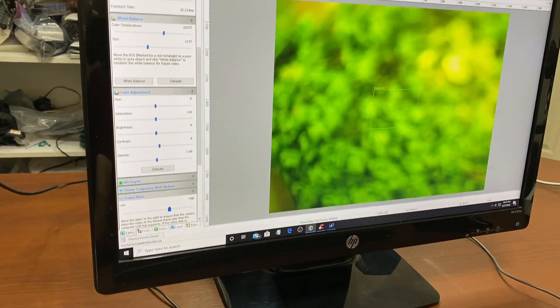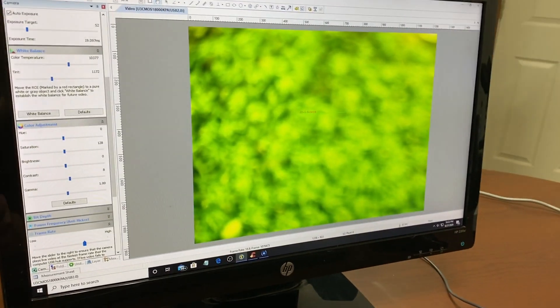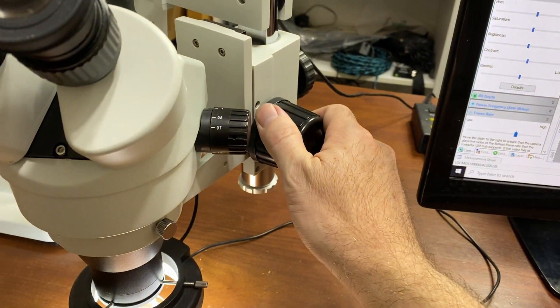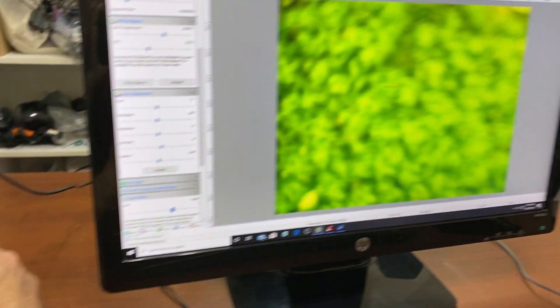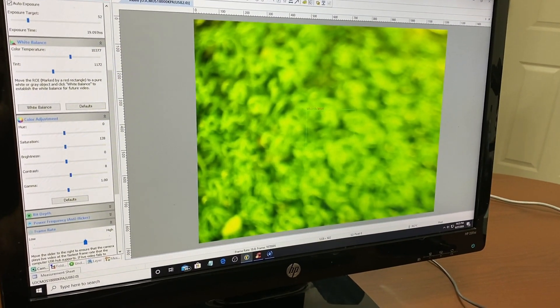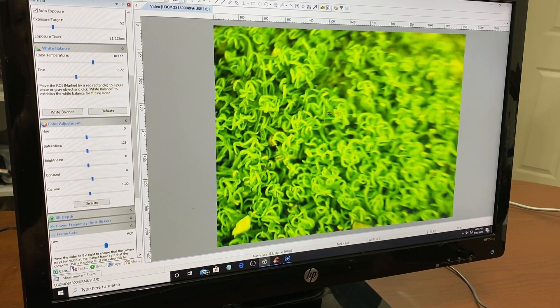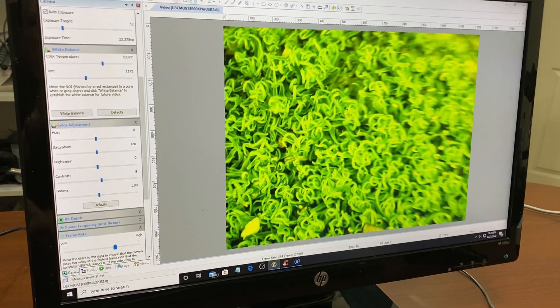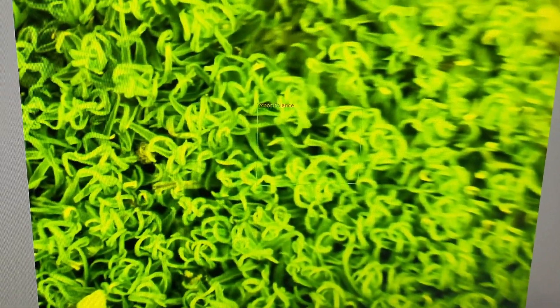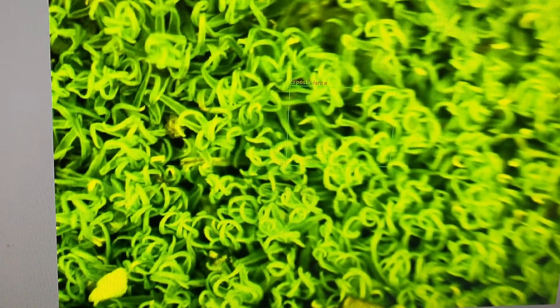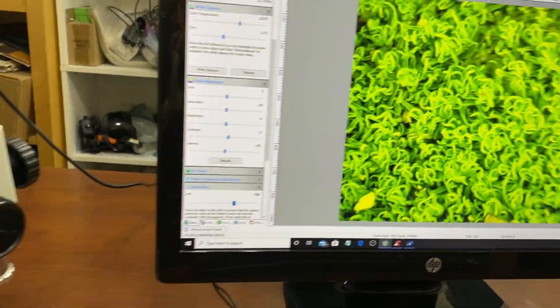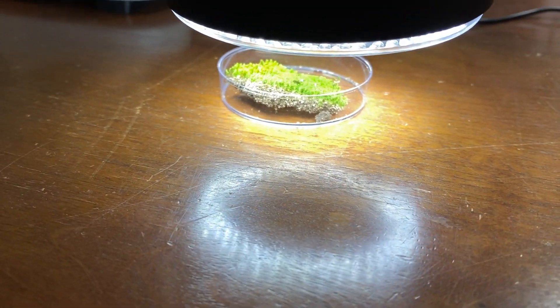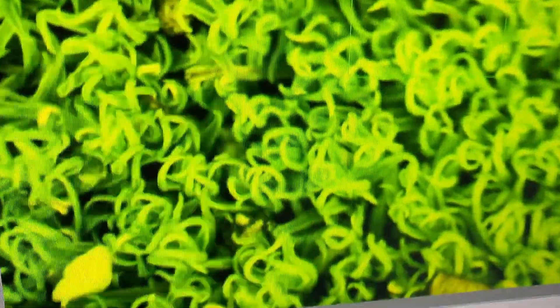I'll try to get that centered. And right now it's blurry so let me go ahead and get it cleared up. There we go. Take a look at that. Is that neat or what? That's little moss. So it's right down in there. And that's what you get when you magnify it.